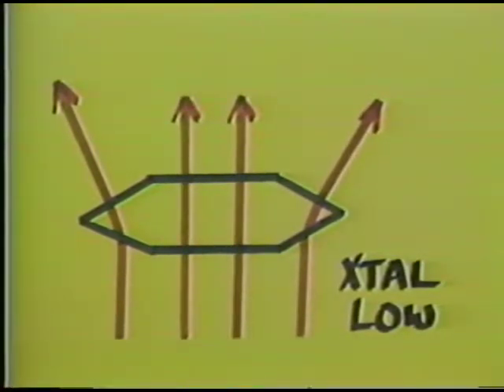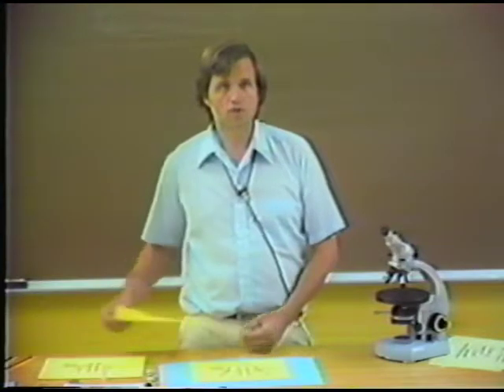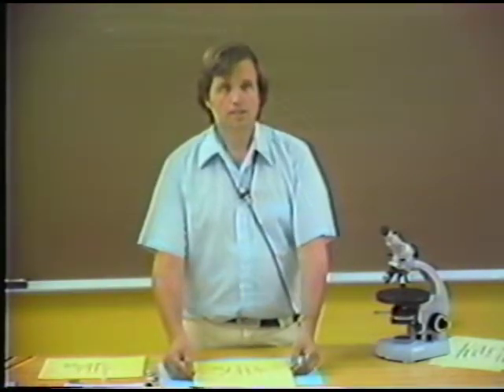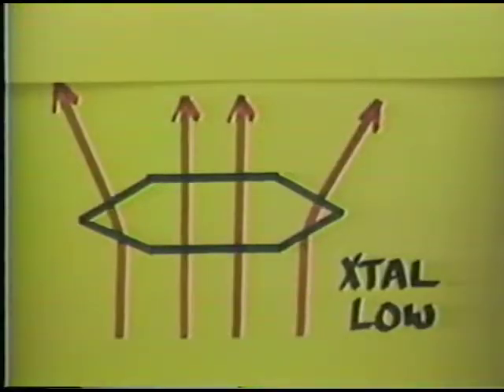There is no difference in the angle of incidence and the angle of refraction. But if there's an angle, as there is in the thinner parts of the edges of the crystal, then the light is actually refracted at the edges. And when we raise the plane of focus of the microscope, I can show this by using another card on this diagram. By raising the plane of focus in the microscope, you can imagine what parts of the crystal you may be seeing.